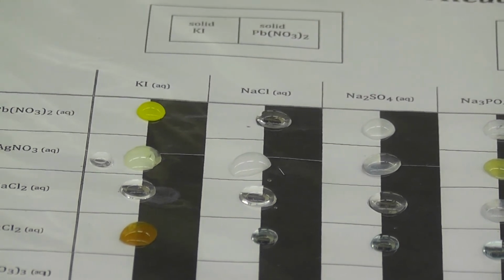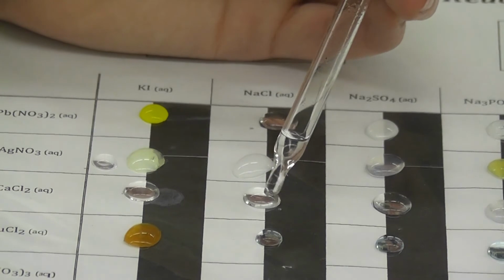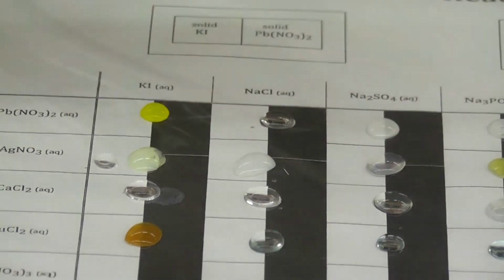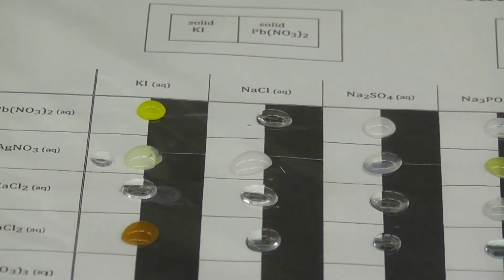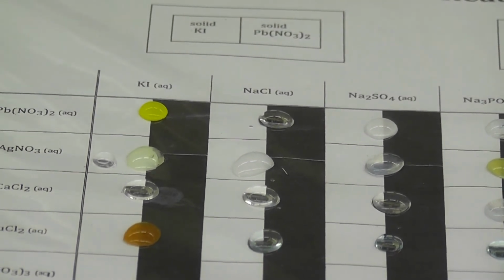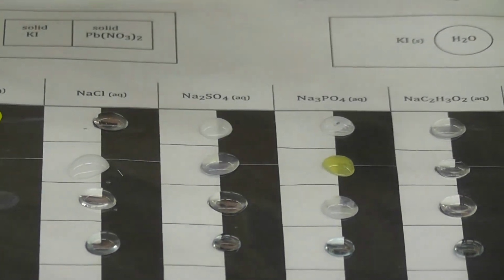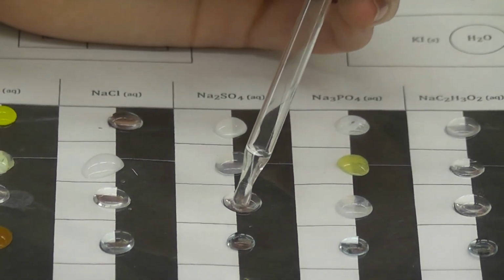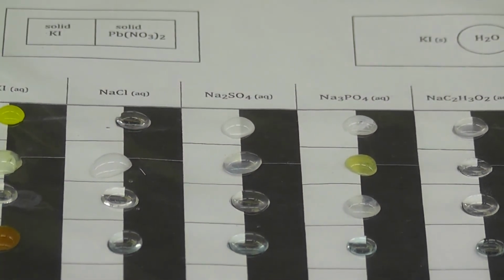Next is the copper 2 chloride mixed with sodium chloride. So I'm going to do a drop of sodium chloride here. Okay, observe that reaction. Now it's the copper 2 chloride with the sodium sulfate. So 1 drop of sodium sulfate. There we go. Okay.